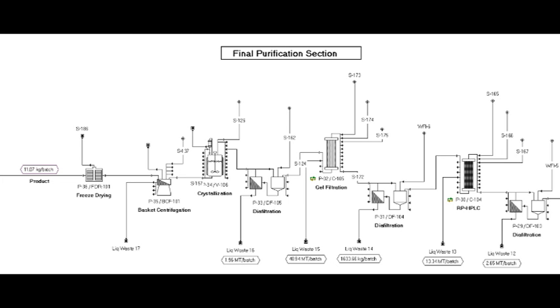The HPLC buffer is exchanged with WFI and concentrated to approximately 170 liters in a diafilter that has a product recovery yield of 98%, 2% denatures.